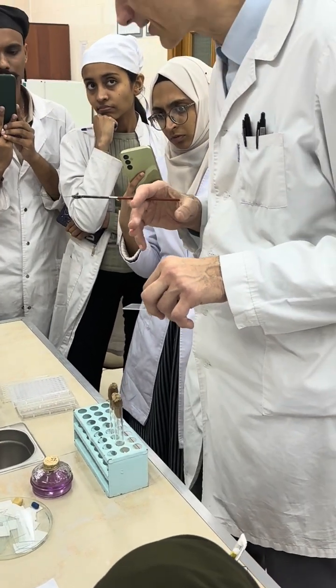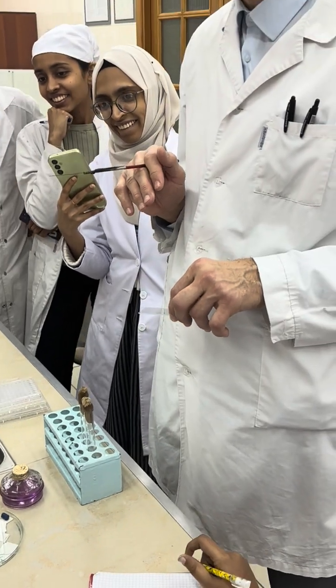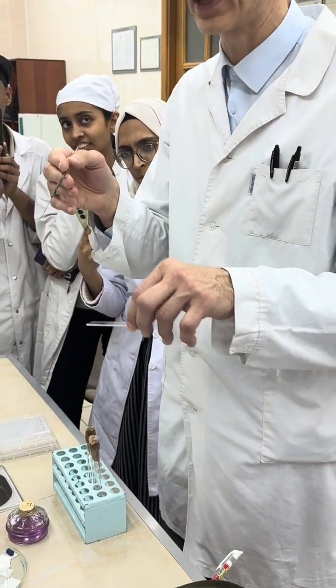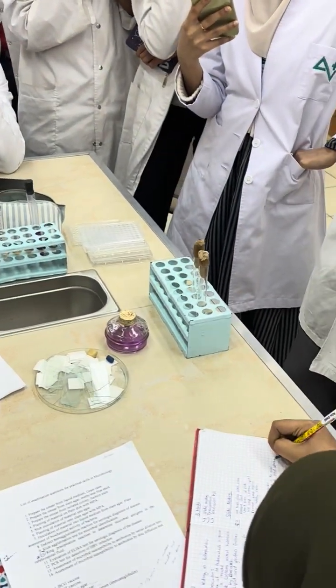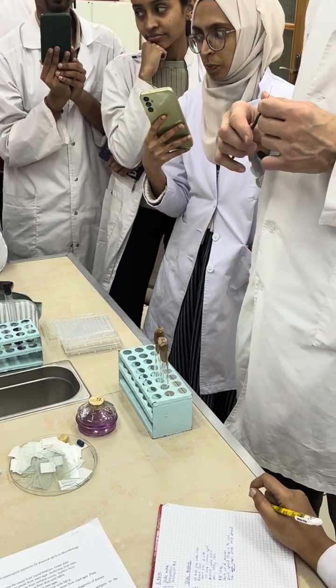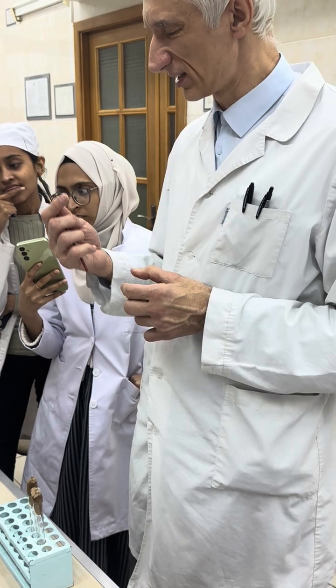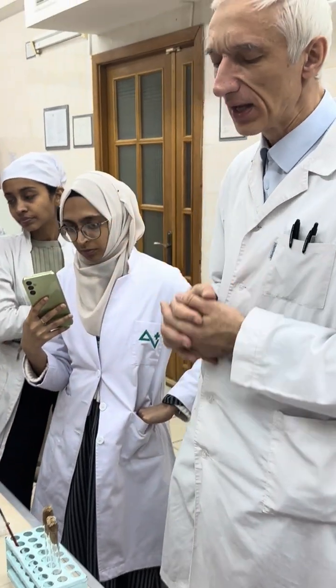You said the drop of saline we do not spread, right? And then add microbes, and after that only spread. Spread as much as possible. After taking saline, we re-sterilize the loop. Of course, before taking, if the loop touches something that was not primarily sterile, it is considered desterilized, so it needs sterilization again. Done. Next.